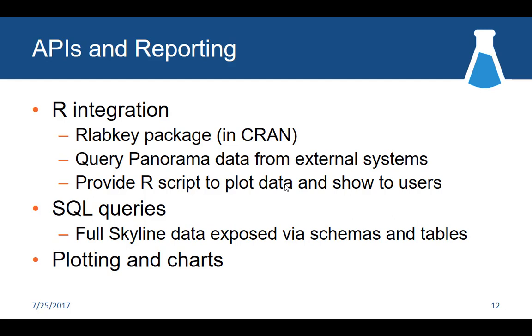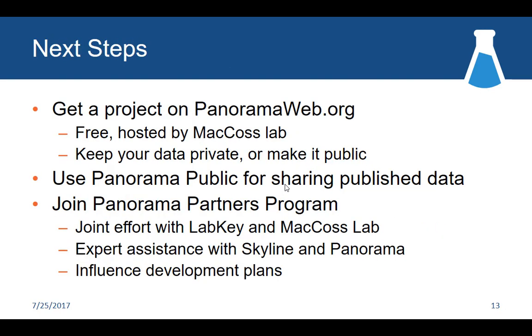And all of the data that we're loading into Panorama goes into a database on the back end. You can also use that to write your own queries over your data. So if anyone is a SQL developer, you can go ahead and do that within Panorama and not have to, say, load into a totally different system. And, like I said, we are importing the full content of the Skyline document. So instead of just having transitions or something like that you might get from a flat export, you've got that full relational data model behind the scenes.